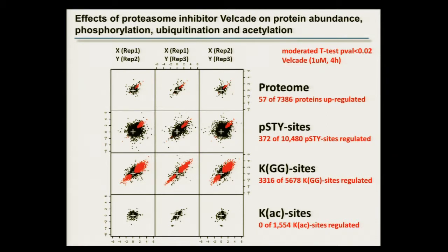And that's an important point because in a lot of studies, if you look in the literature, full proteome analysis was not undertaken, and sometimes you really can't tell is it a change due to stoichiometry changes or due to protein expression changes.